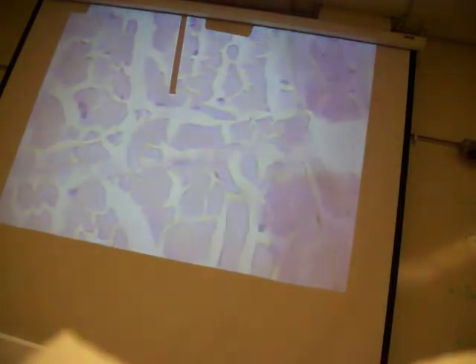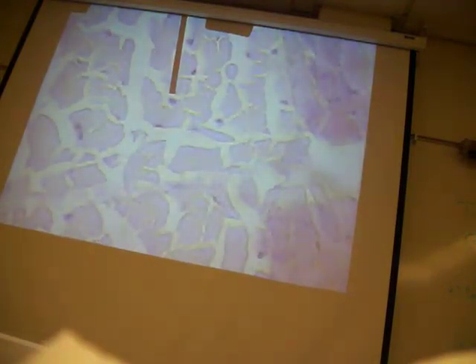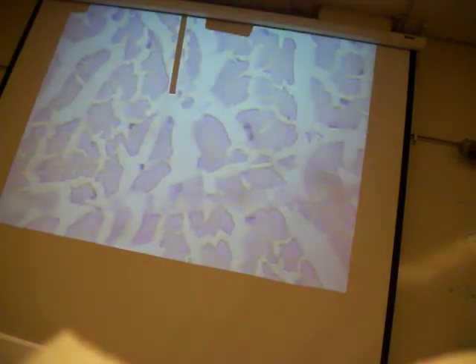And then when you take a look at them at cross section, you can see the fibroblasts in between the fibers. Okay, so here's the cross section of which. So now what we're going to switch over to is we're going to take a look at bone.